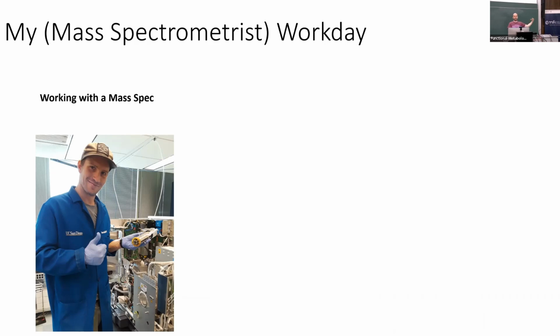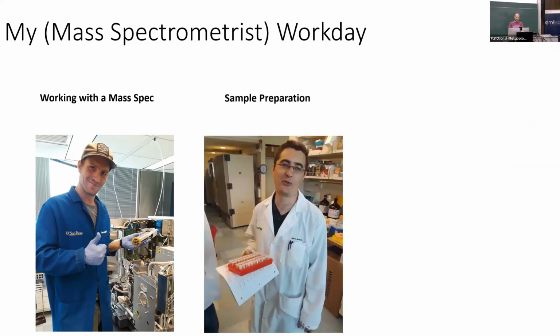I come very much from the instrument side. So I'm a wet lab chemist, analytical chemist. I've worked with mass spec for a long time, and I love spending time in the lab working on the machine, taking out quadrupoles and so on.